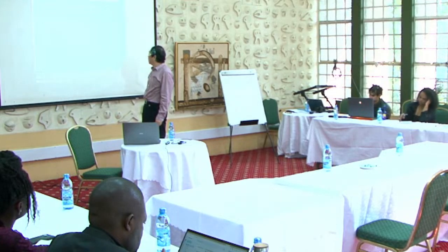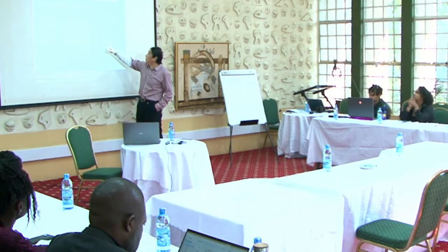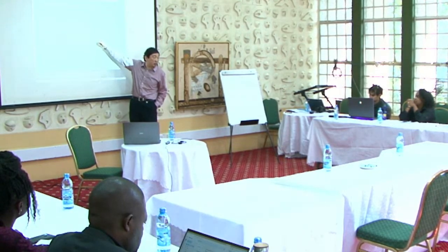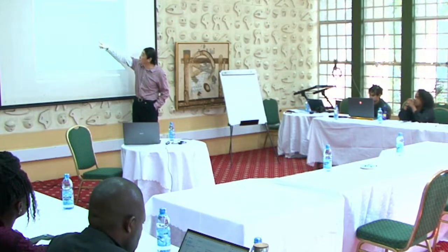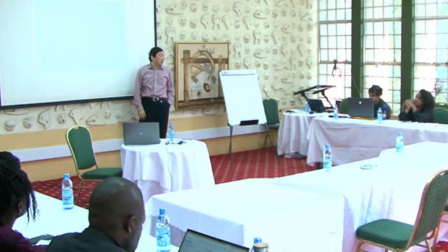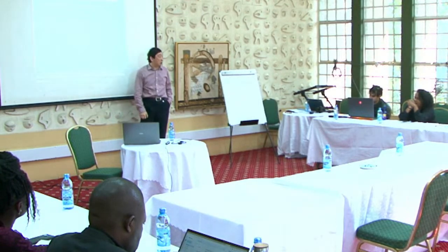And the peak at 41 is very strong. A strong 41 indicates you prefer this structure. Since you have a branch here, you break from the branch, that's a perfect 41. And because you have the allyl bond stabilized, that 41 is strong.